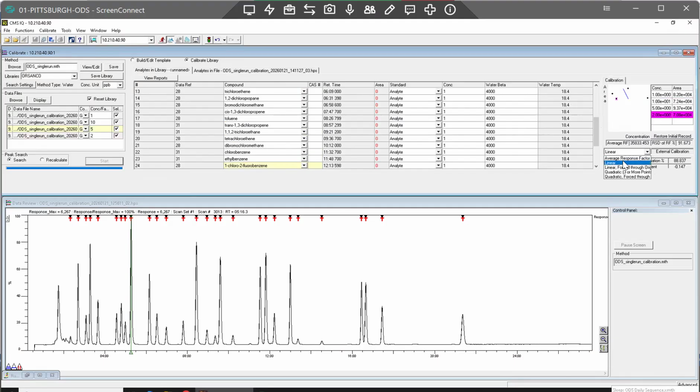Okay, I don't know about that. Oh, maybe I can change that to average response. Let's see. Yeah, I don't know. Not sure about that one. Okay, anyway. Going through, the rest look pretty good. I think there were two or three that were a little bit low, but I'm okay with that.